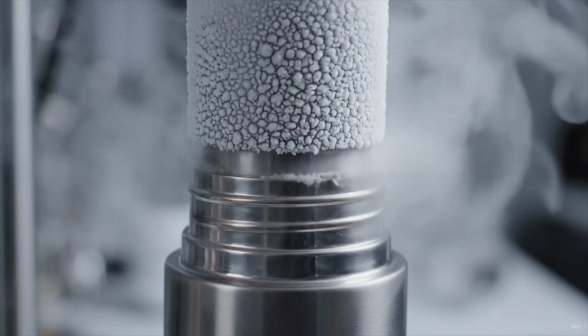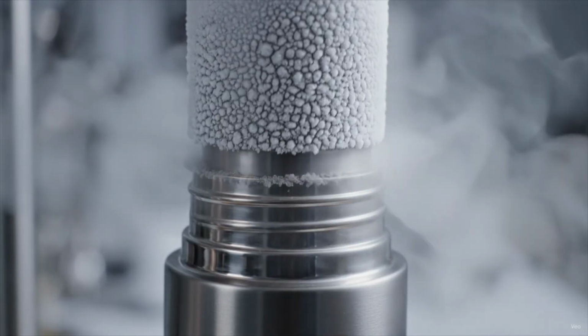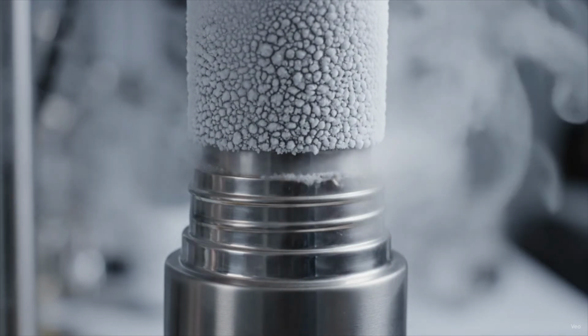You need to exceed the condensation rate of going from gas to liquid, such that you always have a positive pressure in your thermos.